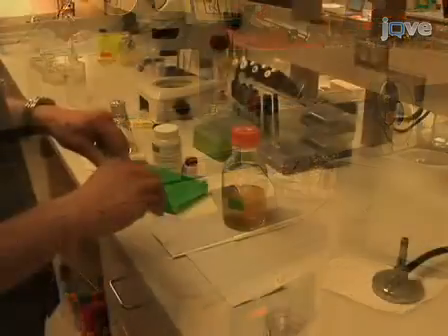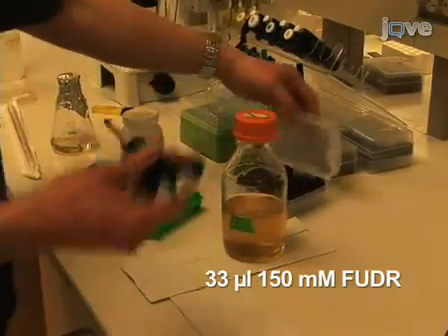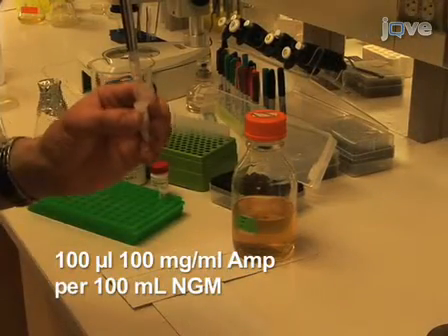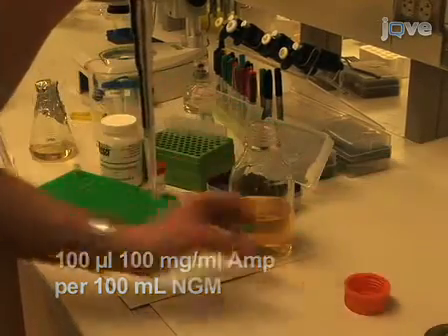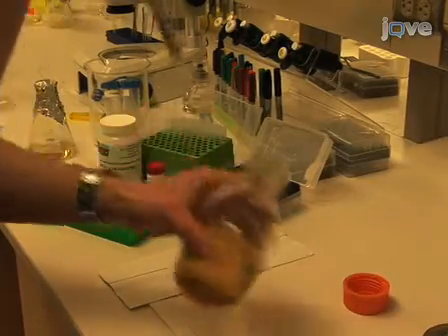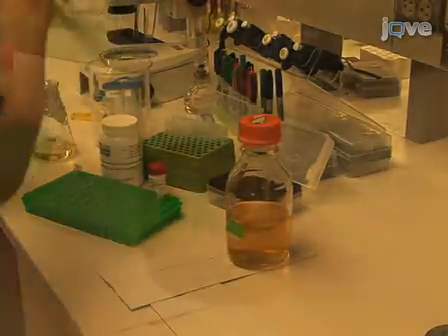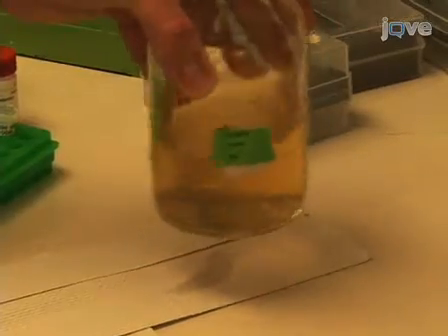For plates with drugs, add 33 microliters of 150 millimolar FUDR and 100 microliters of 100 milligram per milliliter ampicillin per 100 milliliter NGM and swirl to mix. Ampicillin is used to prevent foreign bacterial contamination and FUDR to prevent eggs from hatching, so worms will not need to be transferred every few days in order to separate them from growing larvae.